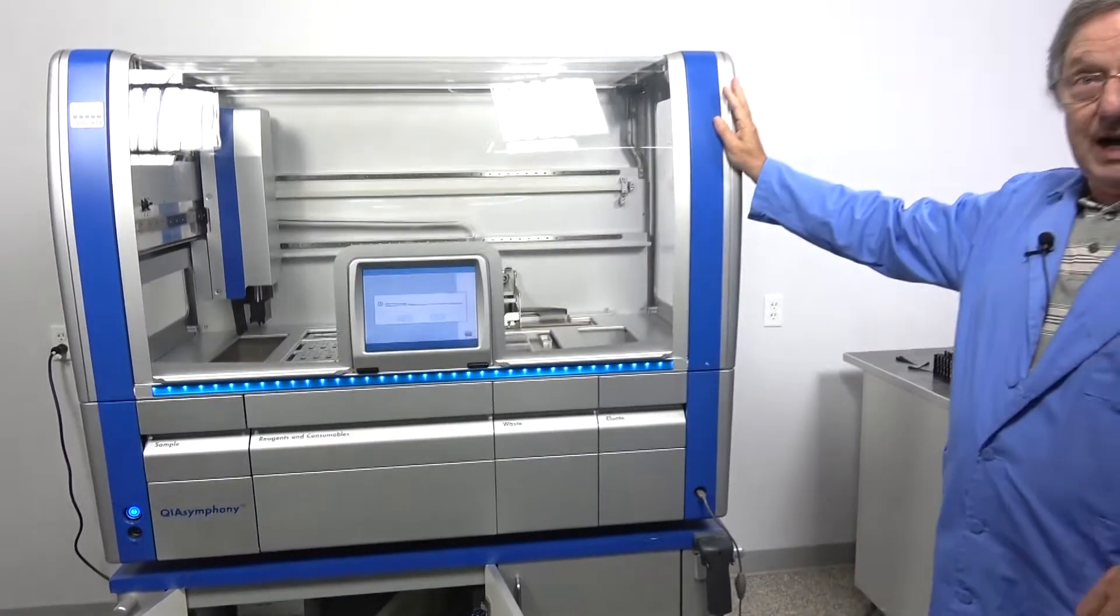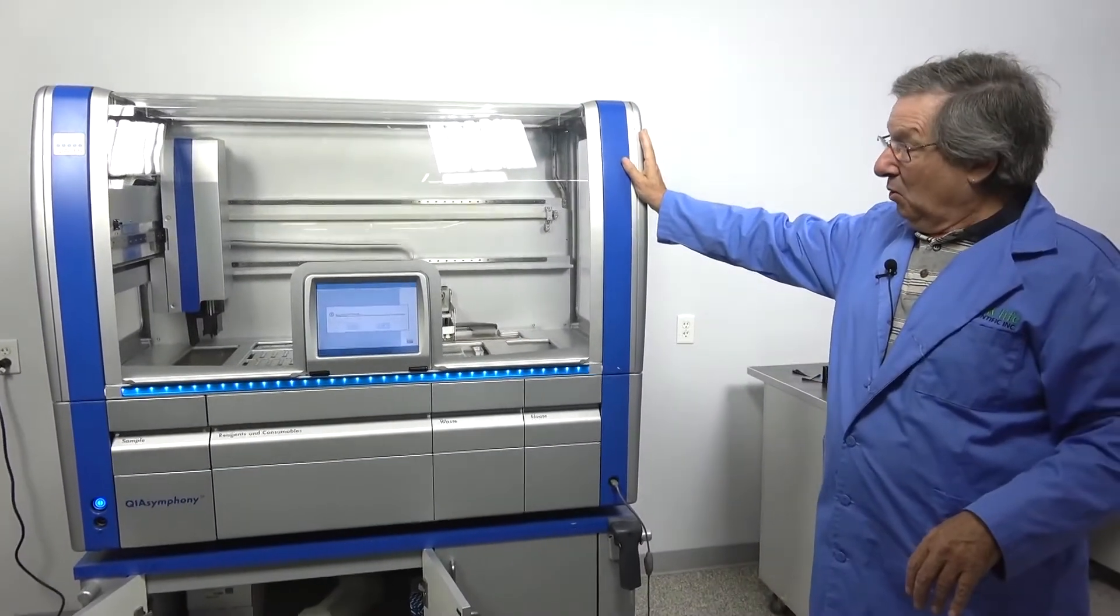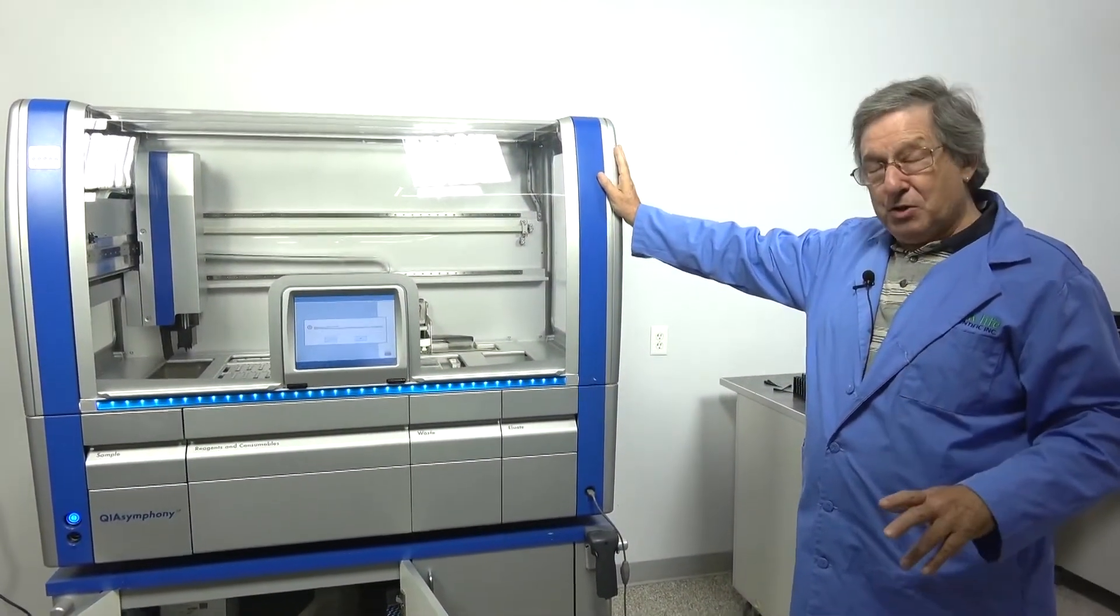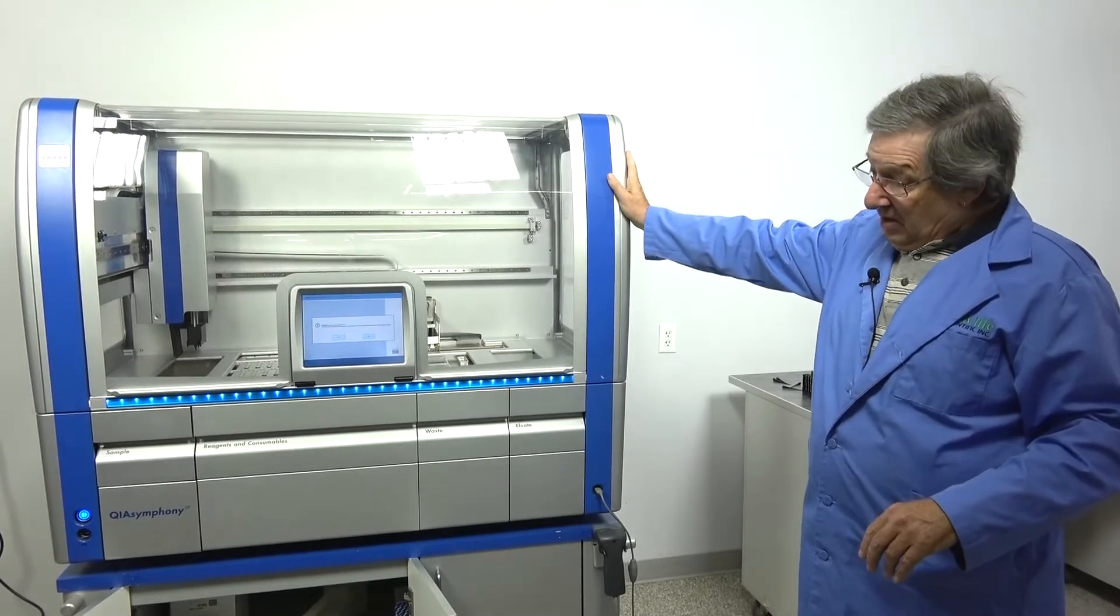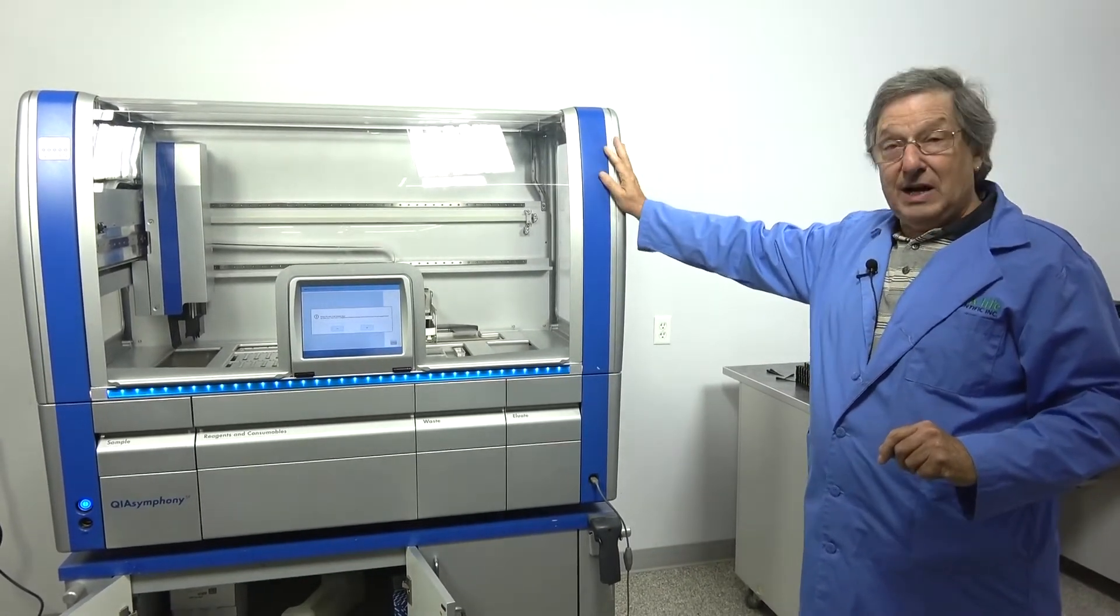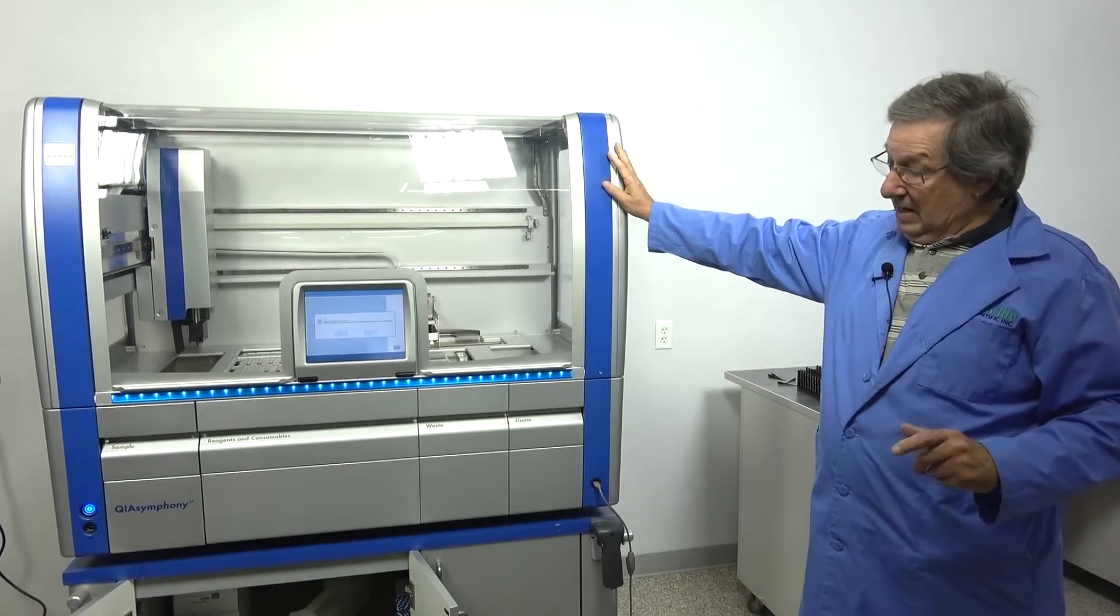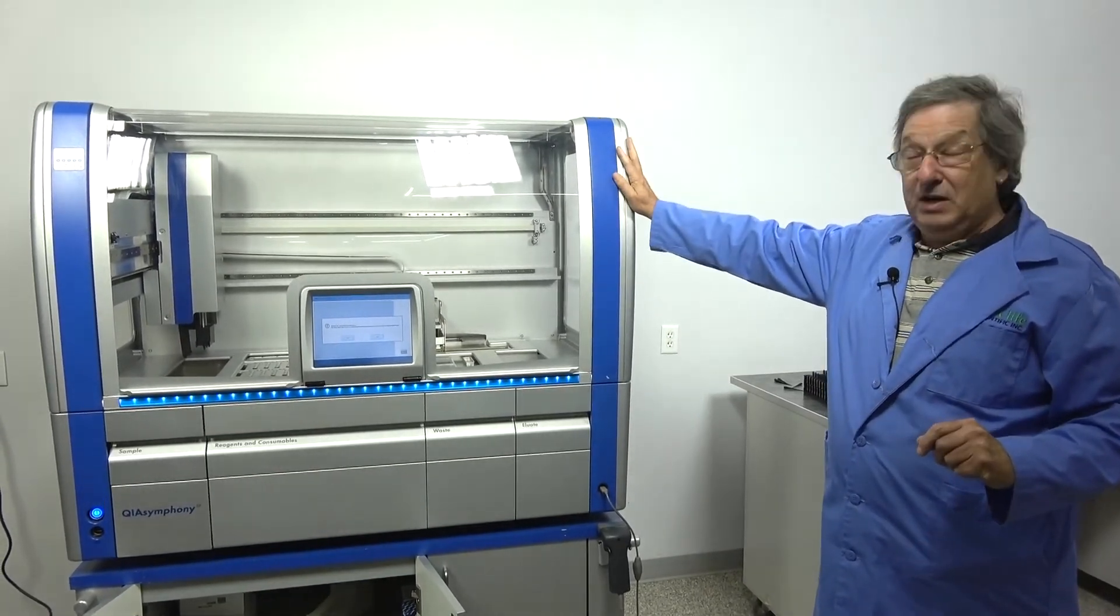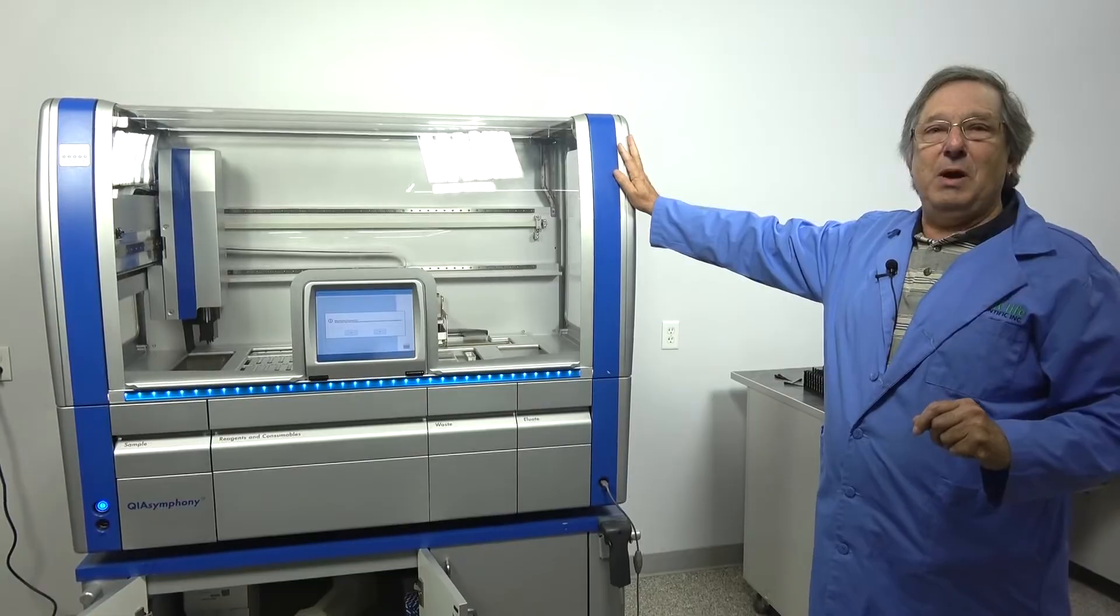And with that, that's our Qiagen. That's our testing regiment. A major portion of it. We do quite a bit more. If you have any questions, please let us know. We always try to have these in stock on hand. So if you need one of these, let us know. Thank you very much.